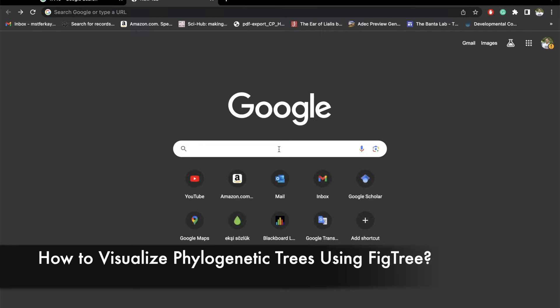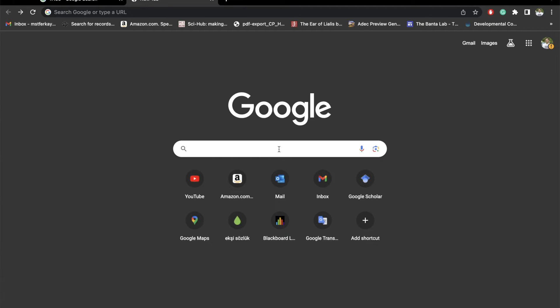In the second part of this tutorial, I'm going to show you how to use FigTree to visualize the phylogenetic trees that we just created.